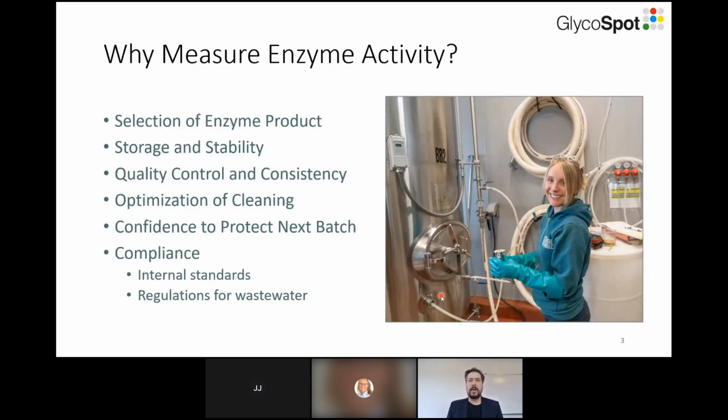By periodically measuring your stocks of chemicals containing enzymes, it's possible to see when a particular batch of product is out of date, or the activity is too low and it's time to order a fresh batch of chemicals.